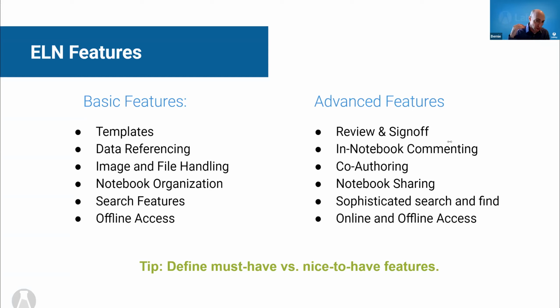You want the ability to include data in your notebooks in some form. You want the ability to handle images and other files that need to be associated with your workup. Notebook organization, you're going to want some ability to organize and categorize your notebooks, and along with that, of course, a mechanism to find those notebooks after the fact in the system.